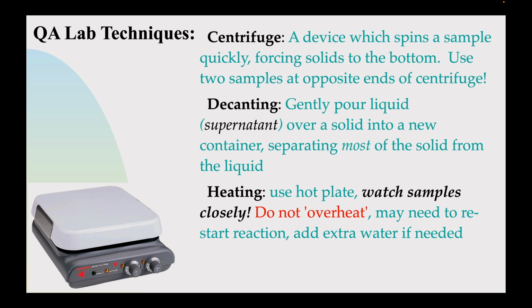So just watch it very carefully. All right, don't let it overheat. You can add a little extra water if you need to, and sometimes that can be really important. So just watch your samples, especially when they're on the hot plate, because they will burn really fast, and then you have problems.